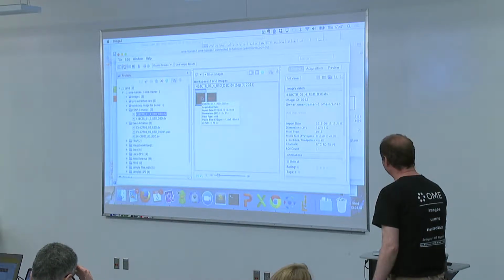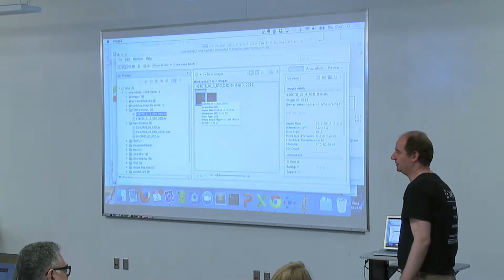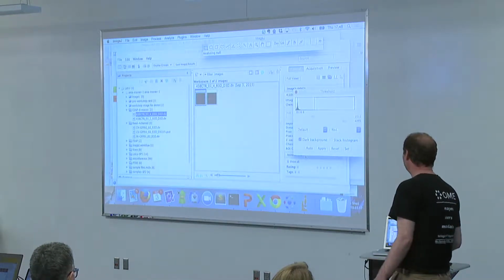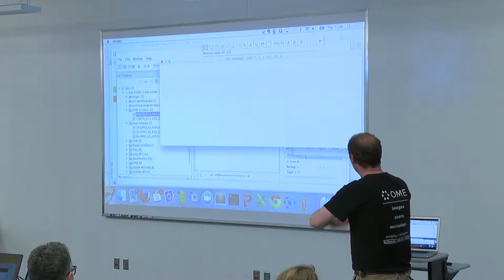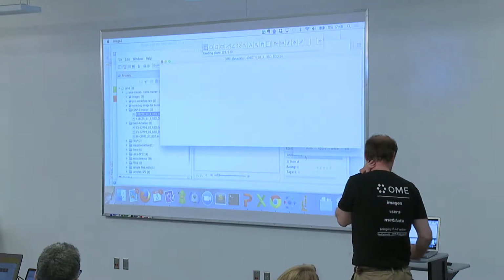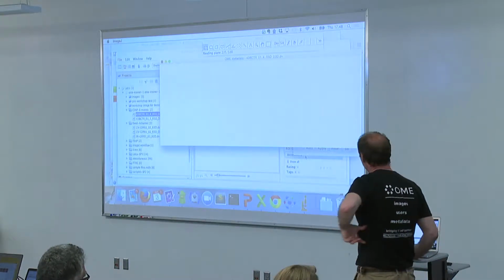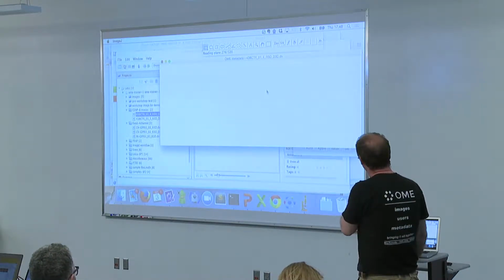So now I'm in the plugin, and the default behavior of the plugin when I'm clicking on the image is to open that image in ImageJ. So this is an image stored already on the server with one region drawn in OMERO, and I'm opening it in ImageJ. We are also doing a fairly good job of having the ROI on the right plane. This is a feature which is some 6 months old, so we are still debugging it, but it's much better even now than the thing which I'm showing to you. Let it upload all the planes.